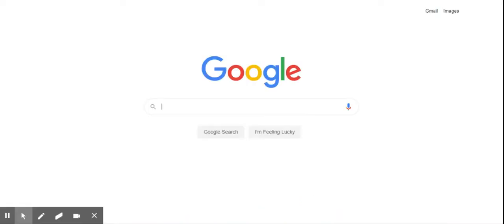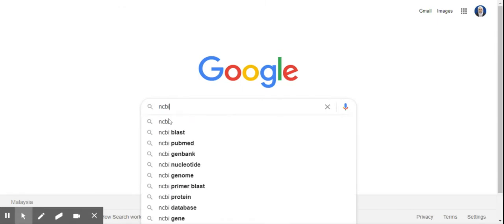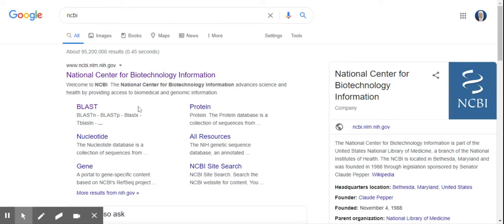Okay, and then you just type in NCBI. Okay, let's click on that one.